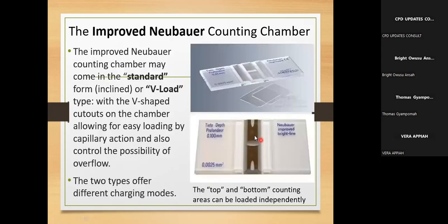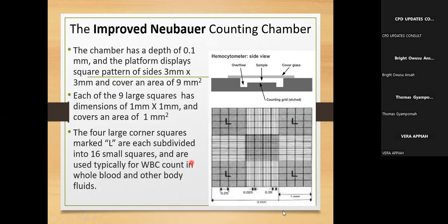So on this, if you look here, I'm sure all of you have seen cover slips before. You see, if you look here, there is an indication of a cross. The lines have been ruled vertically and horizontally. And therefore, here is where you have your rulings, called the grid. The rulings are here and here. Okay, right. And this is the nature of the rulings.